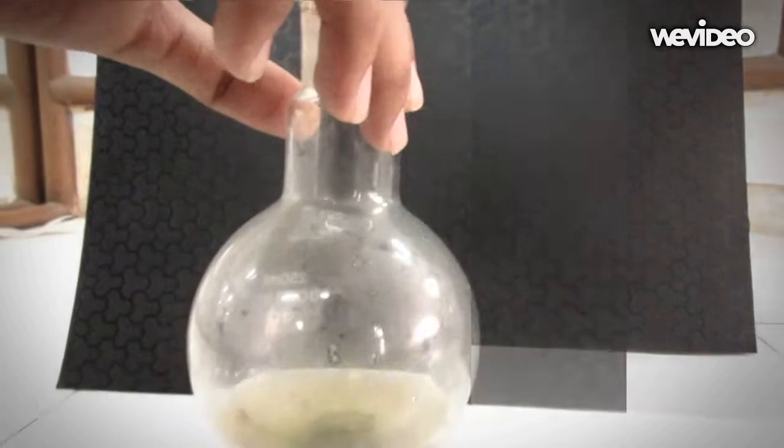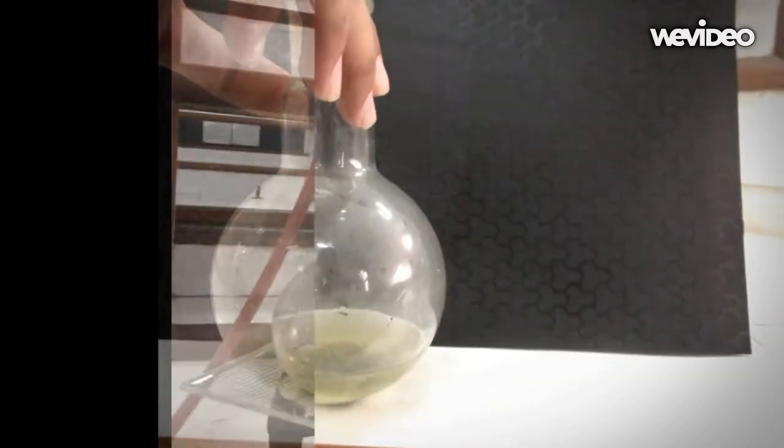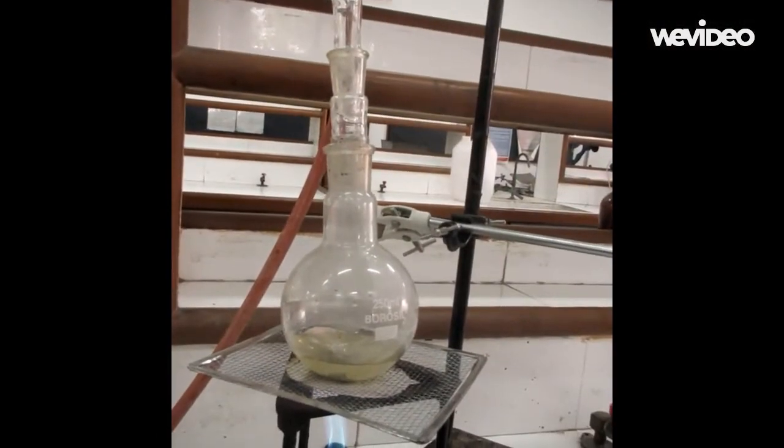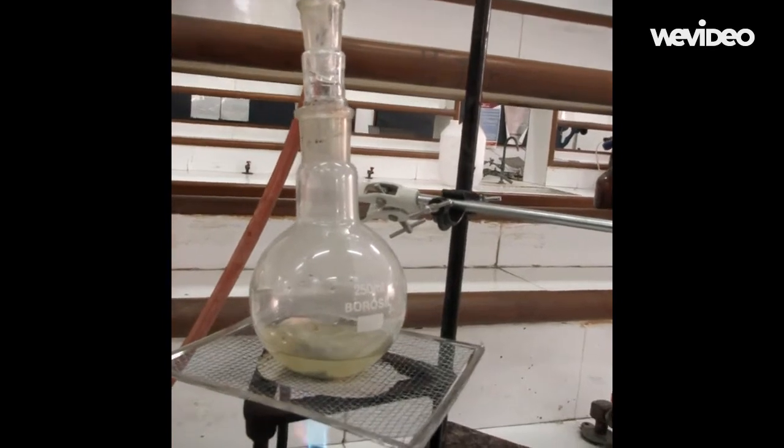To 10 milliliters of aniline, add 0.5 grams of zinc granules in a round bottom flask. Keep the flask containing aniline and zinc granules on a setup like this.